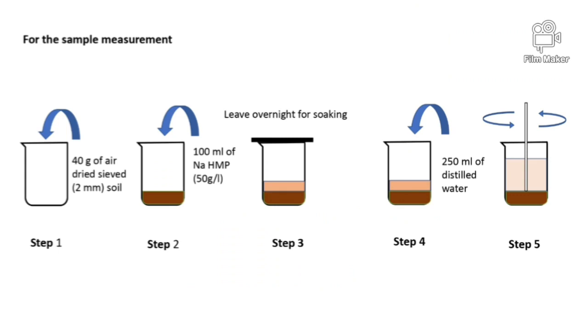First, add 40 grams of air dried sieved soil into the beaker. Then add 100 milliliters of sodium hexametaphosphate into it. Leave the solution overnight for soaking.